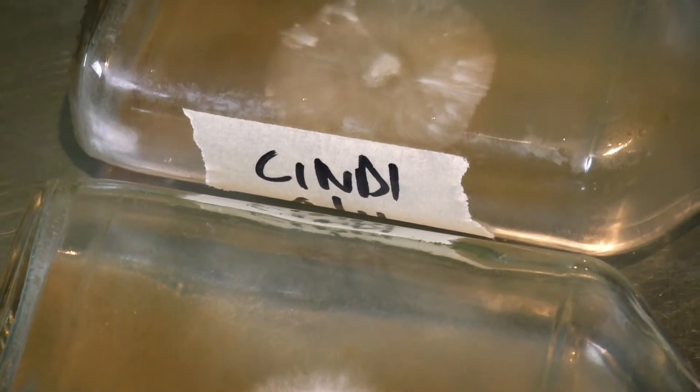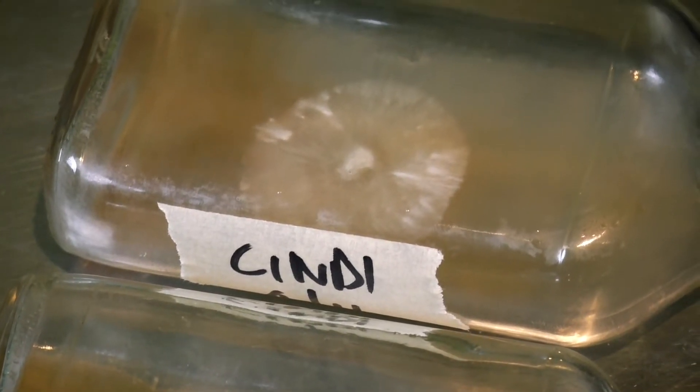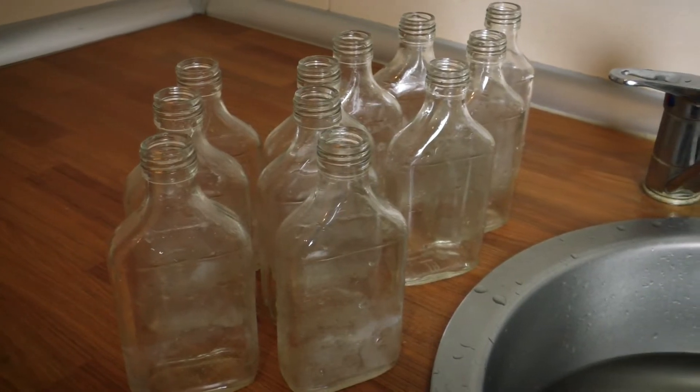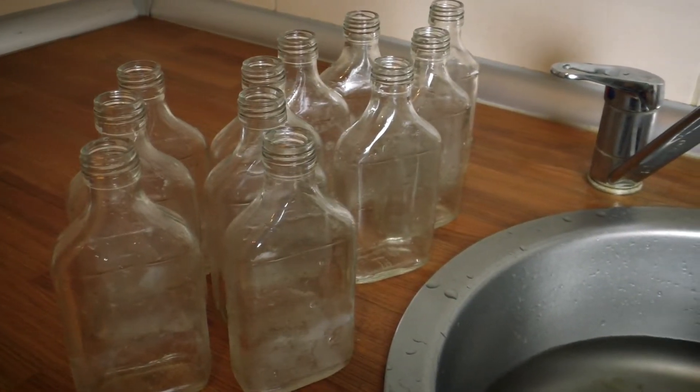The bottles I use are 200ml flat glass bottles. I bought these off eBay really cheap. You could also ask an alcoholic relative to save some for you.